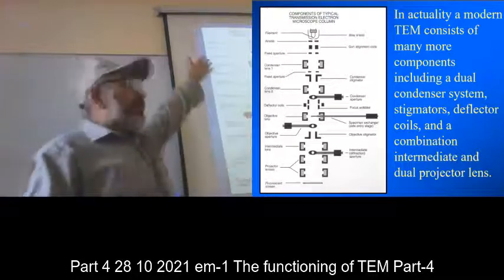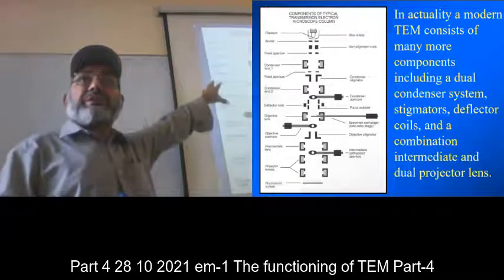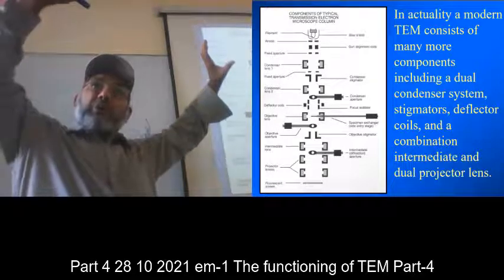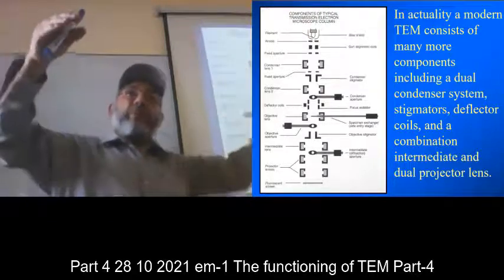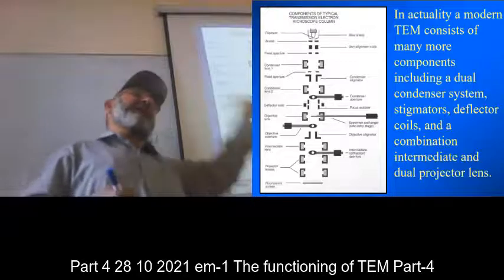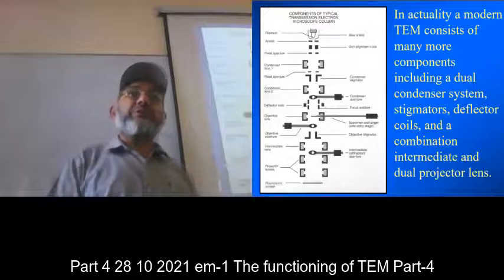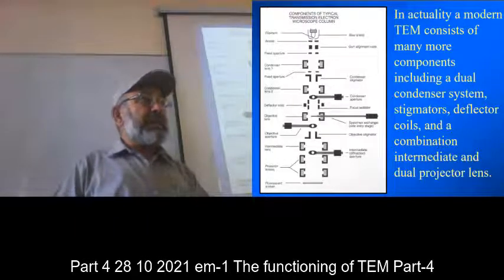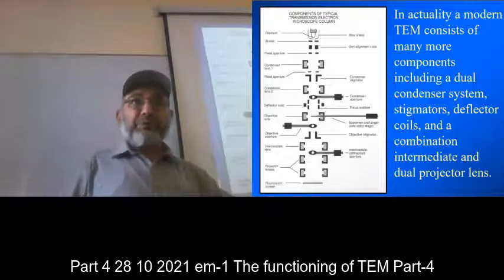Because if you look into all these things, you have to deal with all these knobs. There are knobs for these, there are goniometers for these. So you are just like sitting in an aeroplane, and an aeroplane is also very, very simple in comparison to this. You are tilting the sample and translating the sample with your feet under the table.